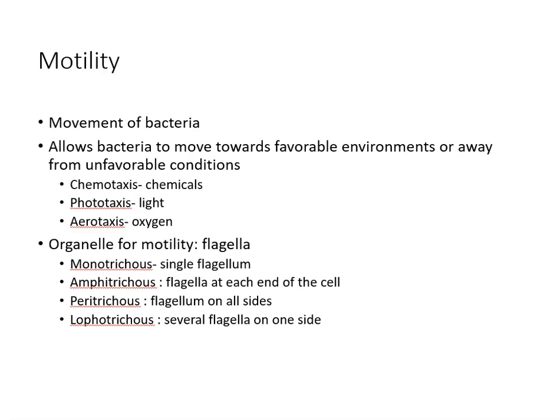Now, how do they move? They move by generally flagella. I mean, some of your protozoans do something different, but for bacteria, they move usually by their lovely little flagella. And we use the word trichous. Trichous meaning hair. That's what it translates to. So monotrichous, one flagellum. Amphitrichous, and I'll show you what they look like.